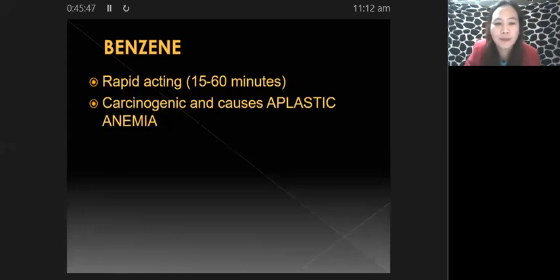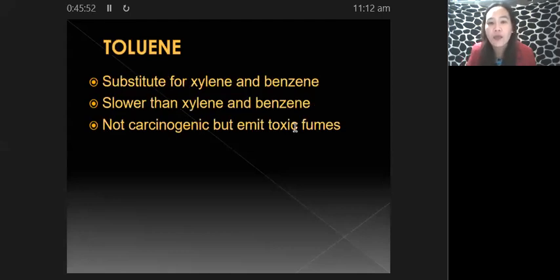All right, I'm back. So the next clearing agent that we will be discussing is your toluene. Your toluene is otherwise referred to as your toluol. Your xylene is otherwise referred to as your xylol. But your benzene, there is no benzool. There is no such term as benzool or benzol.